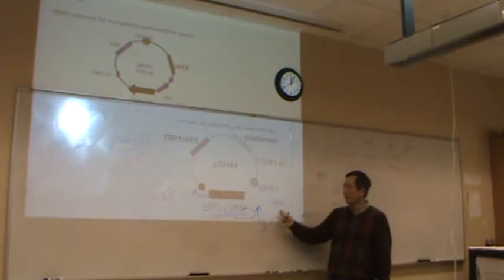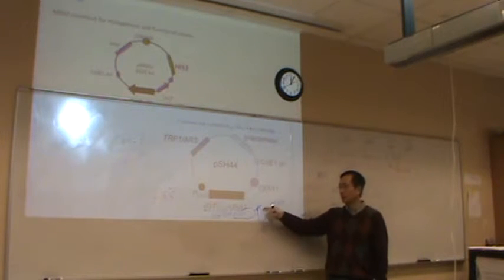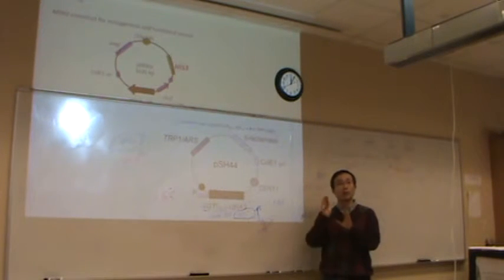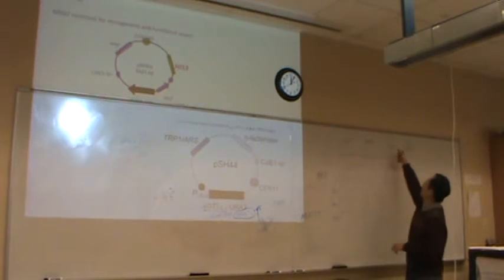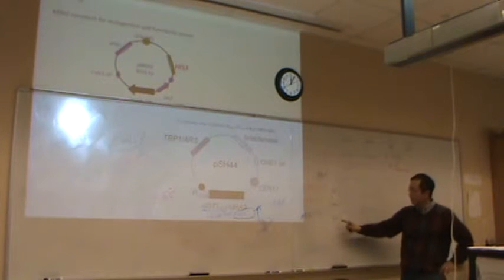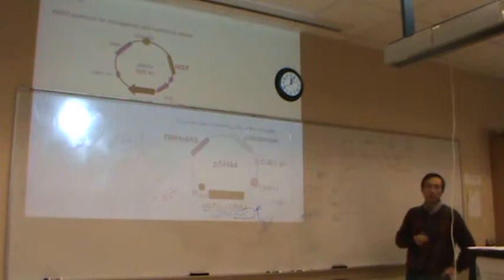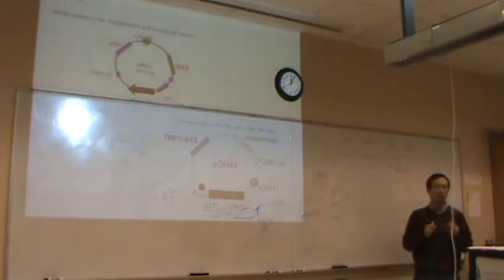Then the conversion of FOA to a toxic compound will be blocked and the cell will live. So for the mutant, we will see some live cells here. But how can we tell the severity of the mutation? The amount of cells there.